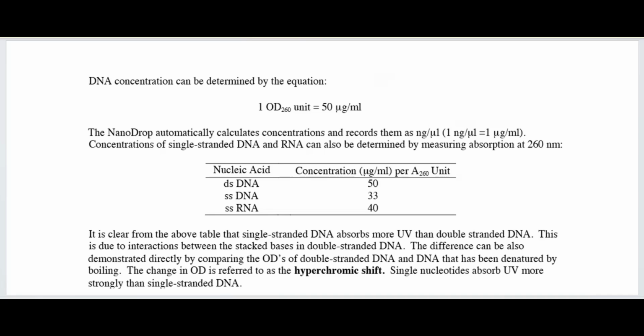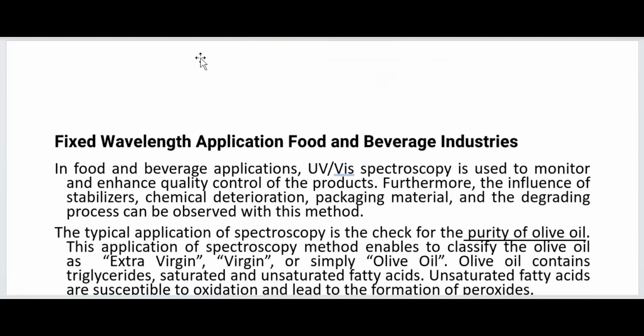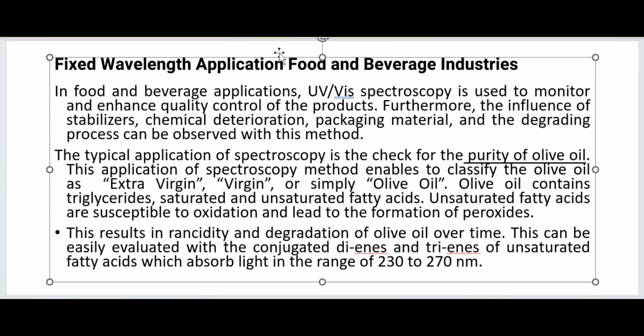So this is another application with respect to the spectrophotometer: when the quantity is very less, that also can be analyzed. Nanodrop technique. Of course, I'm not going to go into much detail about nanodrop. Now, food, beverages, and any pharmaceutical molecules, all these can be analyzed when you are talking about a spectrophotometer. So the presence of any contaminating molecule can be detected simultaneously. Presence of the desired molecule also can be detected.